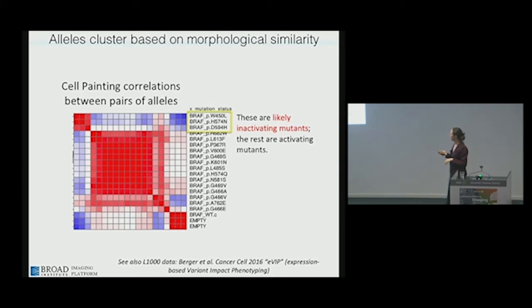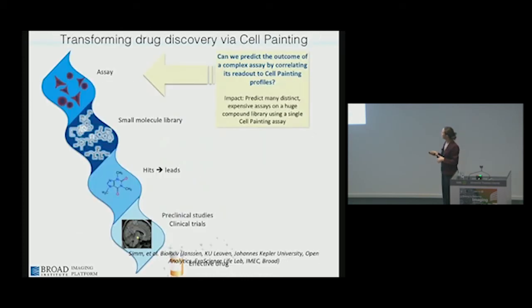And so we're really excited about the potential for this to allow us to rapidly map genes against each other. If you're interested in this concept, it's also been done with mRNA data, and this paper came out just last year on this concept. But we're really excited about the prospect of using imagery just because of its inexpensive nature.